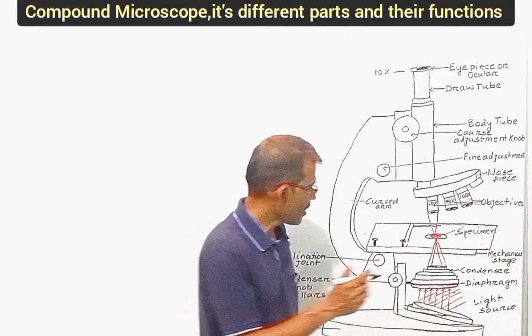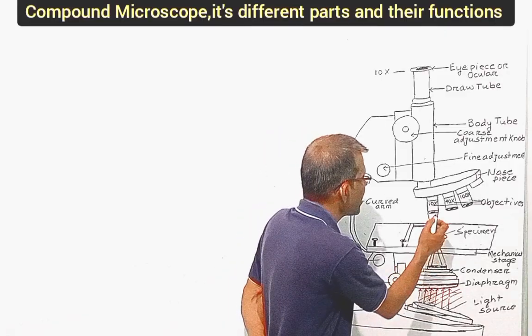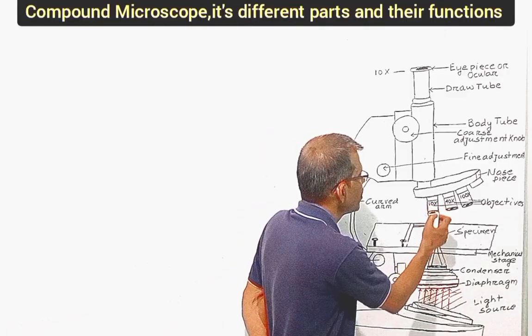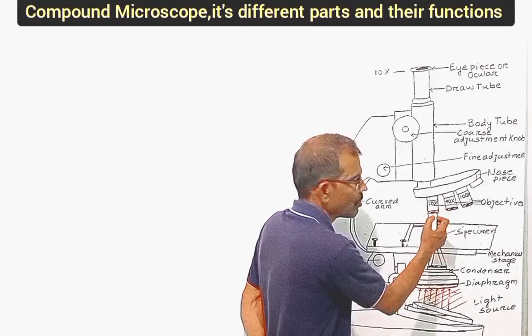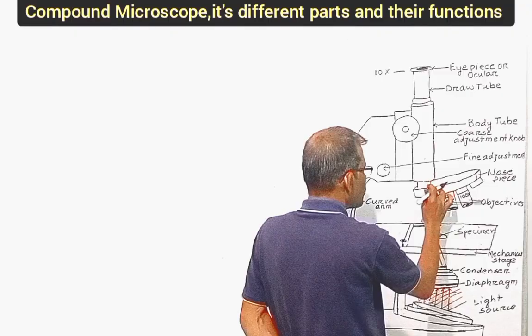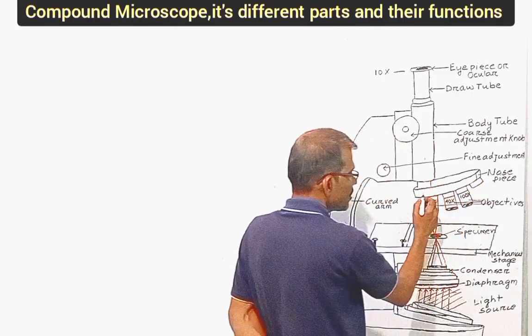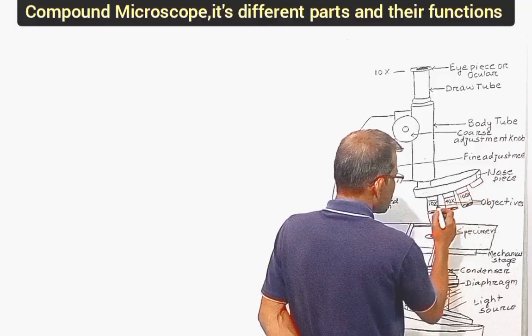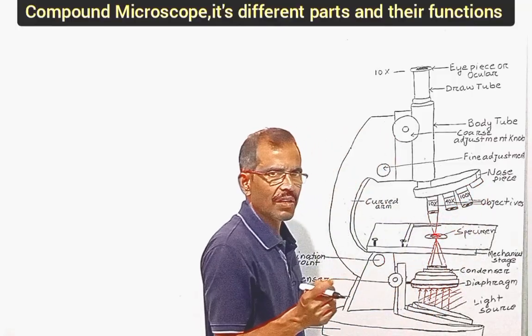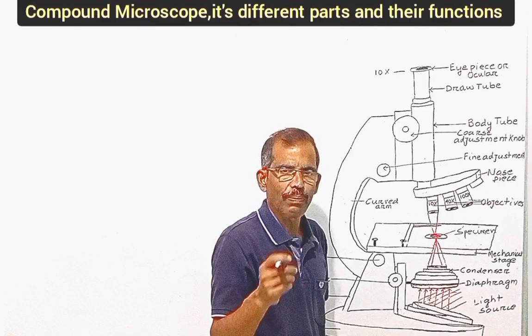So when the light passes through the specimen, it is diverged and then enters the objective lens, which is placed above. In an upright microscope, at the bottom of the body tube, there is a revolving nosepiece. It is associated with three objectives which have different magnifying power and numerical aperture.